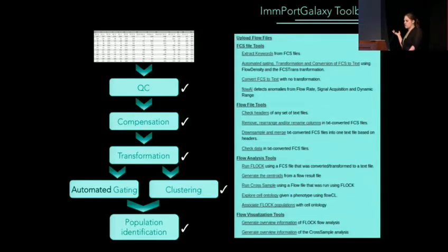So some of those tools take dataset collections as input, or your regular dataset. It doesn't really matter. Some of those tools are written in Python, some of them are R packages, some of them are C, so we have a bunch of everything. And to go back to the workflow, we also have a tool that queries the cell ontology and returns some idea of what your populations are.